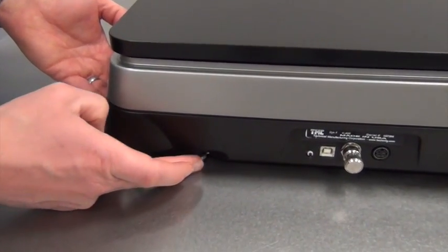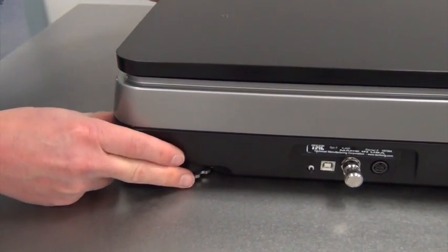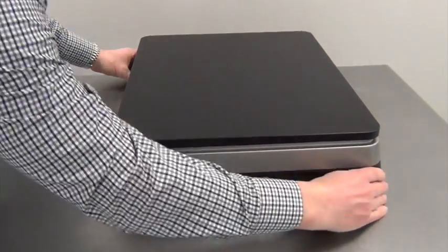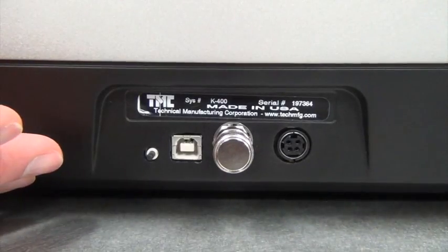Any difference can be easily accounted for by adjusting the single leveling foot on the back of the K400. The leveling wheel can be adjusted by hand until the unit is stable. Always check to ensure there is no wobble.